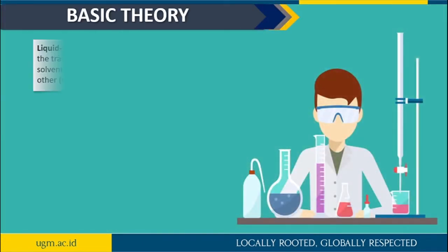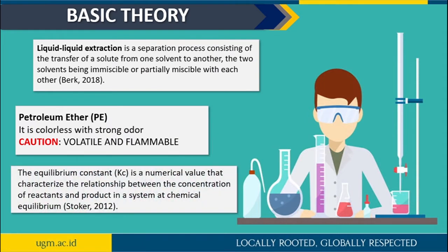In this part, I will explain the basic theory of this experiment. Basically, this experiment applies the technique of liquid-liquid extraction. And what is liquid-liquid extraction? It is a separation process consisting of the transfer of a solute from one solvent to another, the two solvents being immiscible or partially miscible with each other, per 2018.